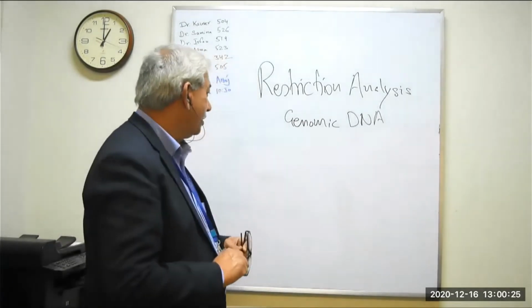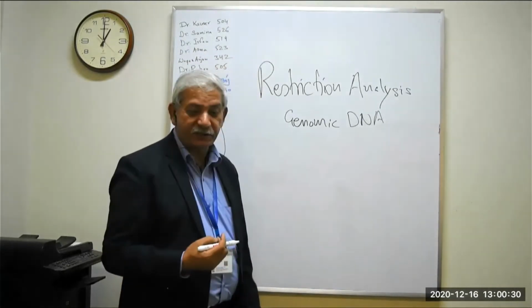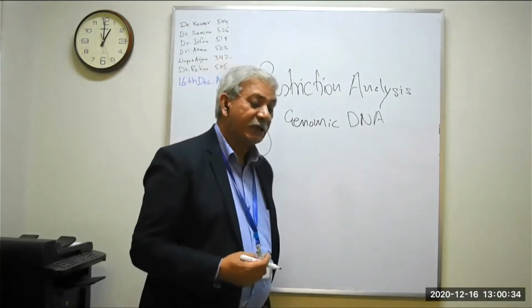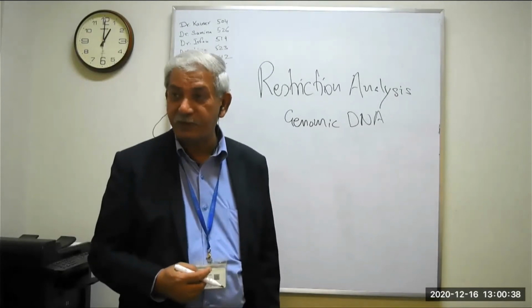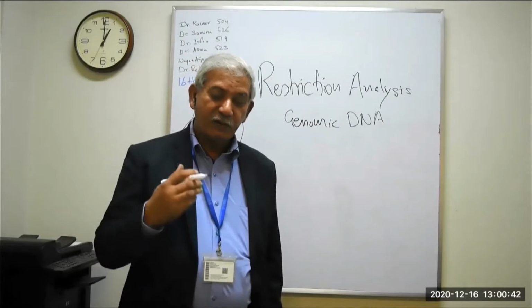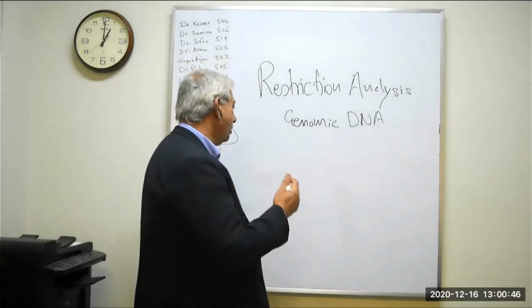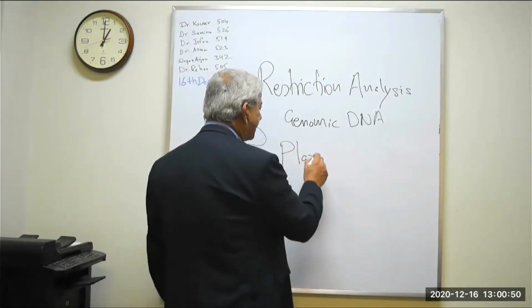So for the restriction setup, we know almost the concentration of the plasmid and the chromosomal DNA, and we loaded about 1 to 2 microliters of our preparation on the wells. In order to see that very clearly, we will use about 3 microliters of the plasmid today.